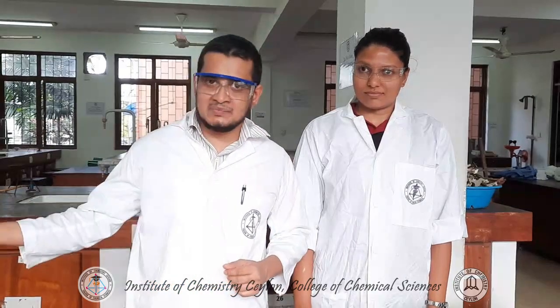Right? So she's wearing the safety eyewear, and you're supposed to wear safety eyewear throughout the experiment. Also, if you are inside the lab, whether or not you are doing an experiment, you are supposed to wear the safety glasses. It can be that your experiment is over and you have cleaned the glassware and you are just doing a calculation, but still your neighbor might be doing some experiment, and if there is an explosion or spill of chemicals, your eyes can still be in danger. So even if you are not doing an experiment, you are supposed to wear safety eyewear inside the lab.